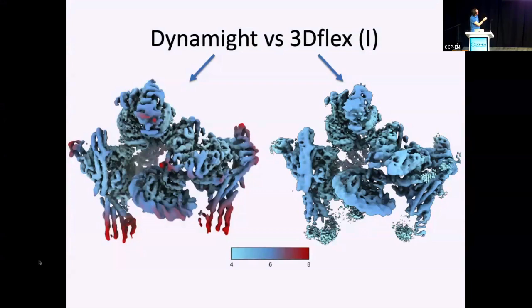Alpha helices that should be separated are not separated. What we think is happening, because we're using completely gold standard separation of our two VAEs, is that we actually get realistic estimates. And actually, I think not only are our estimates of local resolution better than those in the 3D Flex map, the actual quality of the map is also better, because you'll be able to build better models in this map than in that one. But of course you can say, you don't know how to use CryoSPARC, and I will be the very first one to admit this.